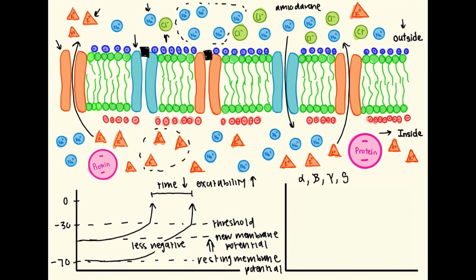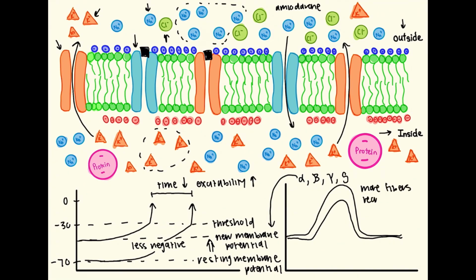The nerve was able to recruit more fibers at each stimulus potential because all the fiber types were more excitable, and therefore each stimulus was able to excite and trigger even traditionally less excitable fibers to fire action potentials, increasing and producing larger CAPs at every stimulus potential.